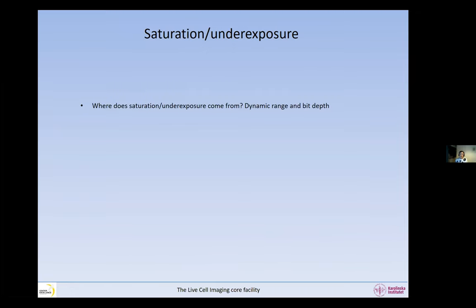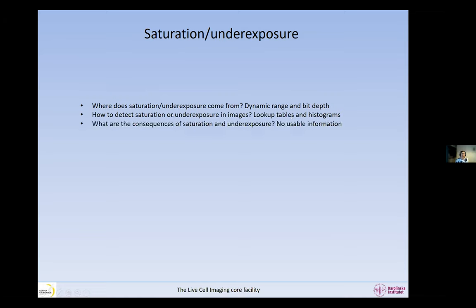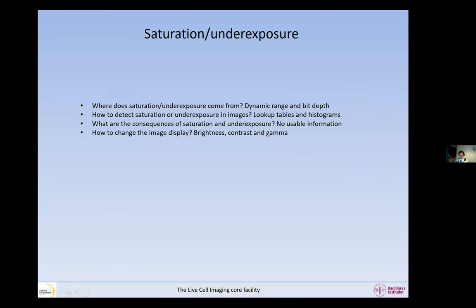So where does saturation or underexposure come from? It's a question of dynamic range and bit depth. I'm going to explain the dynamic range and bit depth. After this, I will talk about how to detect saturation and underexposure using lookup tables and histograms, the consequences of saturation and underexposure, and how to change the display using brightness, contrast, and gamma.